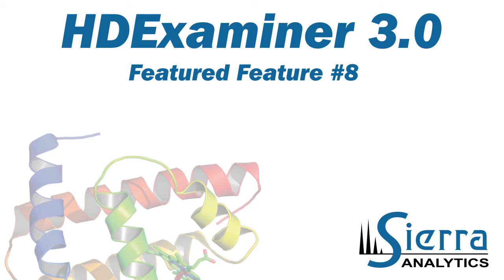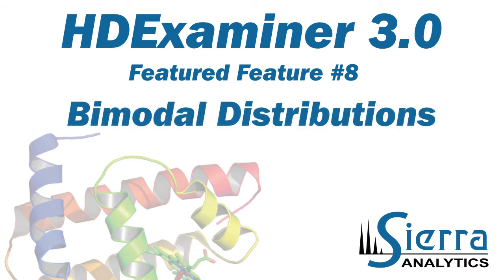Today's featured feature is Bimodal Distributions. This feature is new in HDExaminer 3.0.